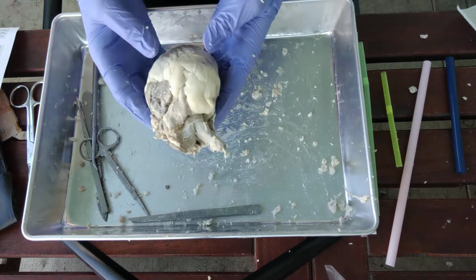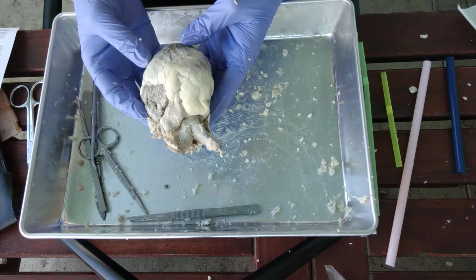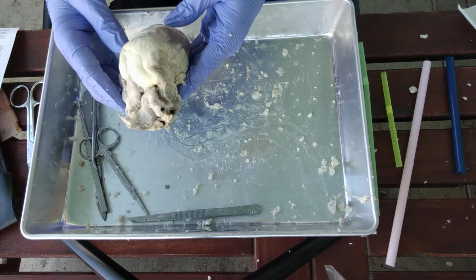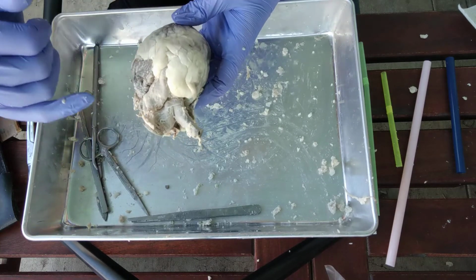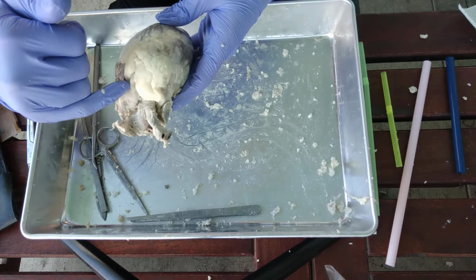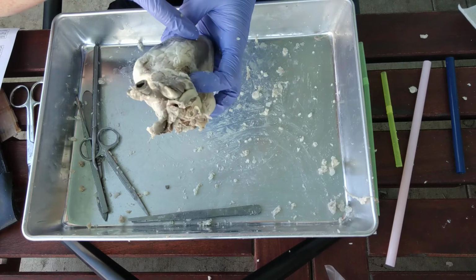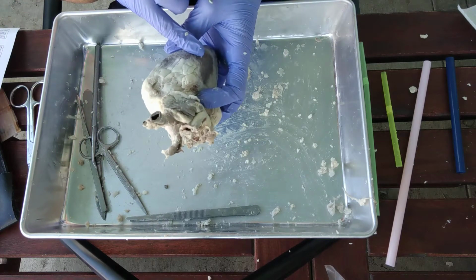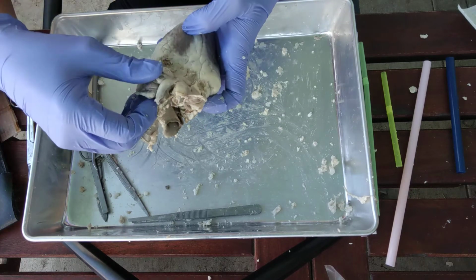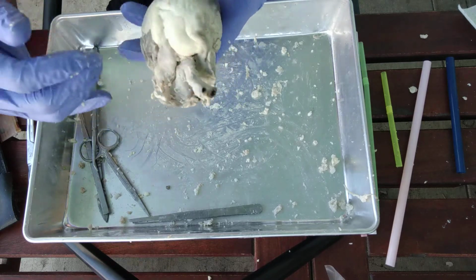Now that we've looked at the external structures, what we're going to do is cut into the heart and look at the internal structures. The first cut we're going to do is a V cut, and we're going to start in this pulmonary trunk. We're going to cut all along the pulmonary trunk, then cut all the way down to the bottom of the right ventricle, and then come all the way back up and cut through the right atrium. Okay, so V cut.